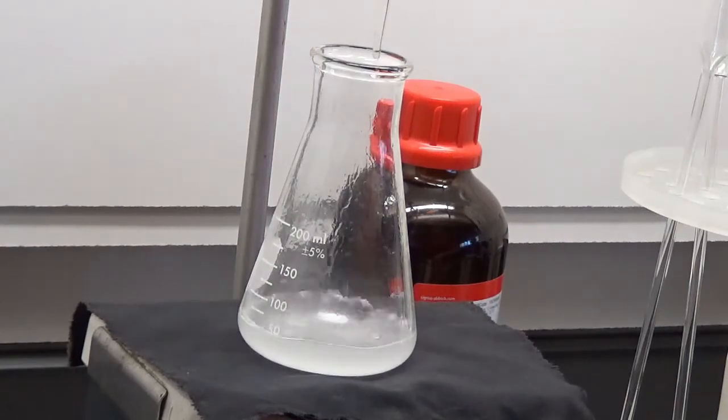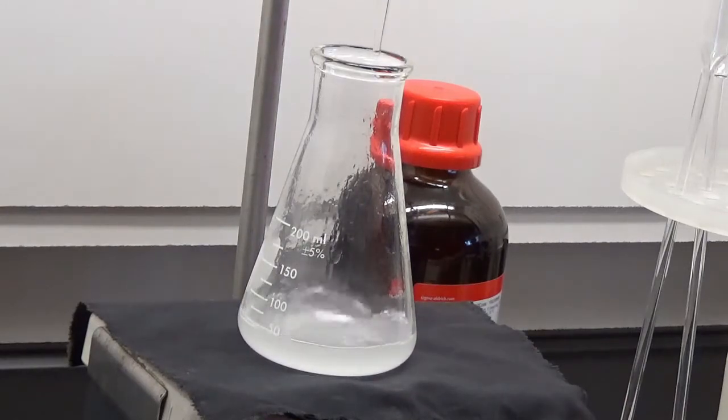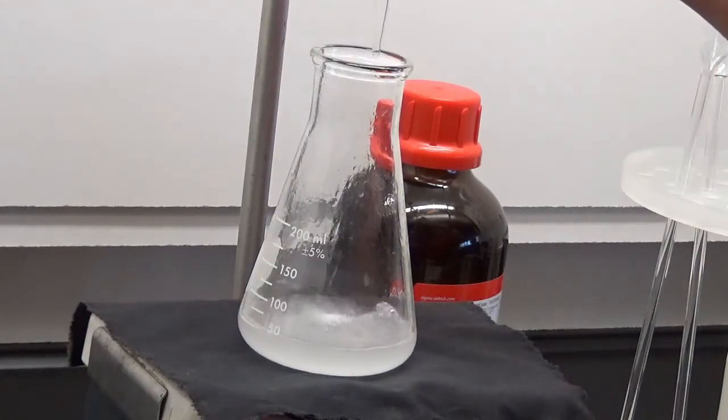Got 7 more drops. Still looks quite cloudy. Another 7 drops. Good. 3 or 4 drops. Cloudy.